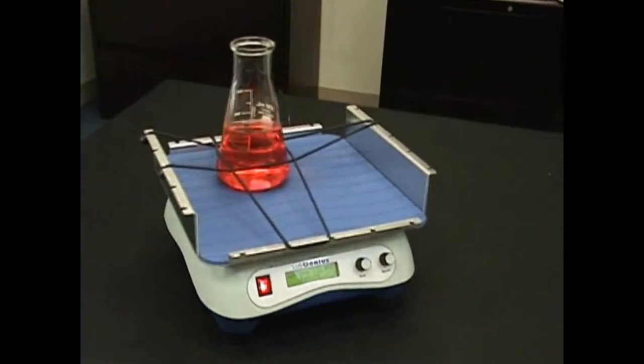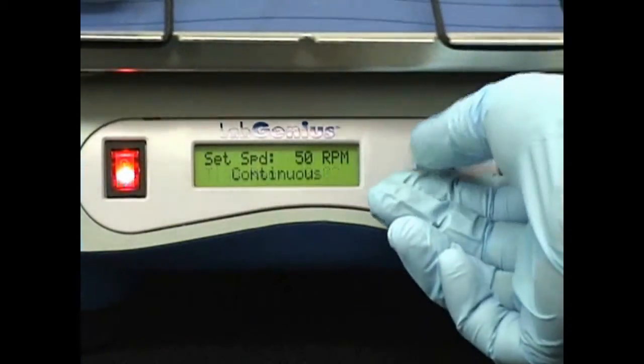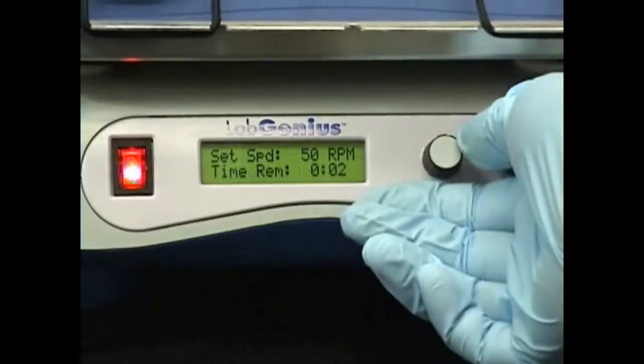Digital display updates, shows, and tracks preset timed run, continuous run, and RPM settings, improving test procedure repeatability.